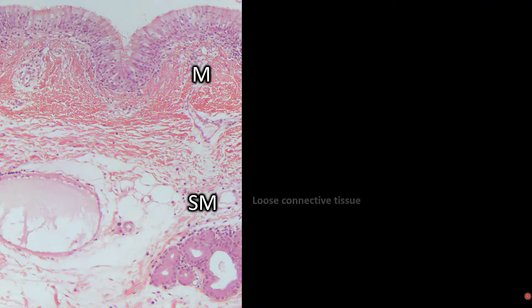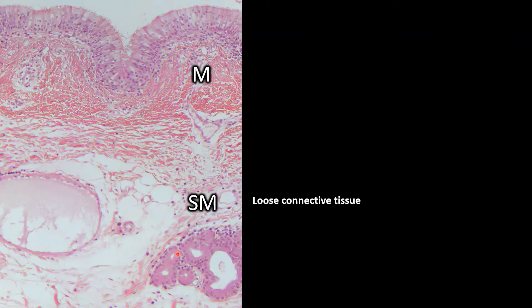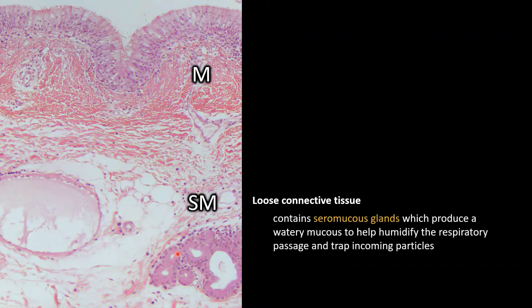Zooming in on the mucosa and submucosa: the submucosa is a loose connective tissue, and in this loose connective tissue you have a bunch of seromucous glands. Glands are made of cuboidal tissue, so any little cheerios made of cuboidal tissue in the submucosa are the seromucous glands. Those glands produce a watery mucus — the watery part humidifies your airway, while the mucusy part helps trap particles, debris, dust, pollen, bacteria, and whatever else you're breathing in.